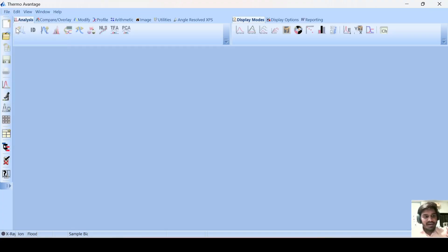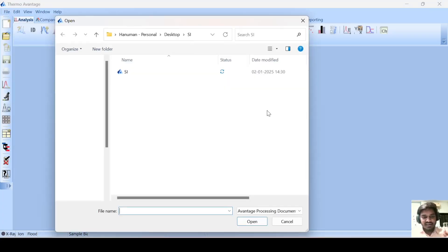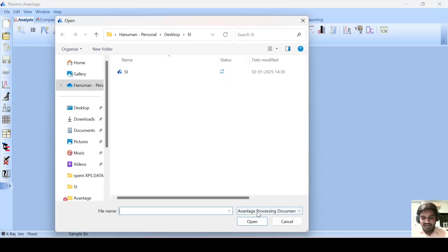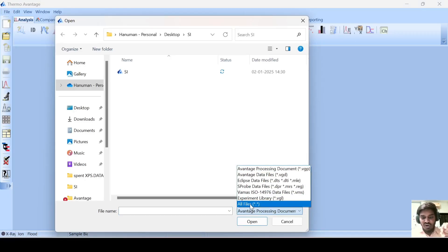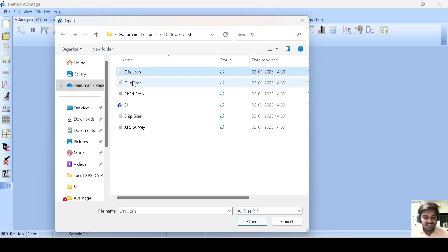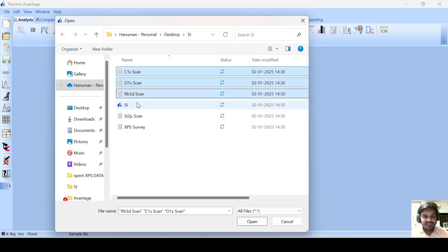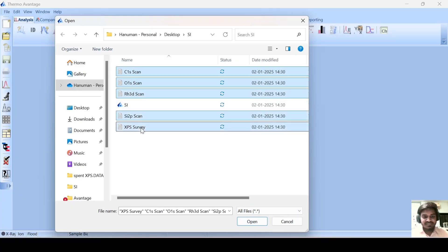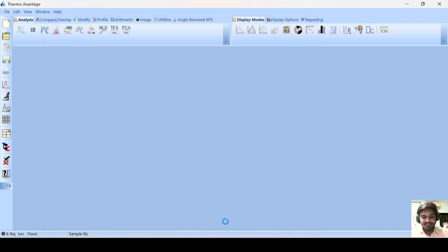First of all, open our data files. Here these files are not showing. You have to do all files here then open. Then click on these files, press Control and then click on these particular files and then open.